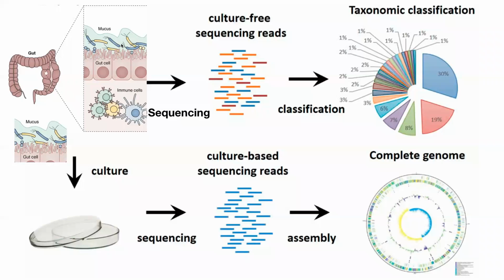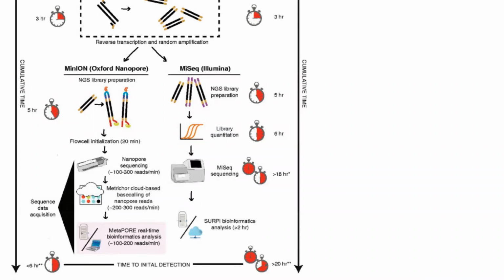So we can actually think of the PCR route when we amplify the material, but that amplification, unfortunately, is not going to uniformly amplify all of the present data, all of the present RNA. So if we use a non-PCR amplification library prep, it's not going to have sufficient material sometimes to study everything that we might want to study. So that's briefly to answer your question.